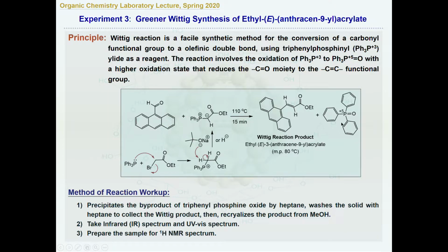Use a spatula, keep stirring or breaking it up, whatever you can do. Hope that everything hidden inside the solid will be able to dissolve out in the heptane. So once you've done 2-3 washings, you combine all the wash solutions together and evaporate the heptane. Now you get more of this product.